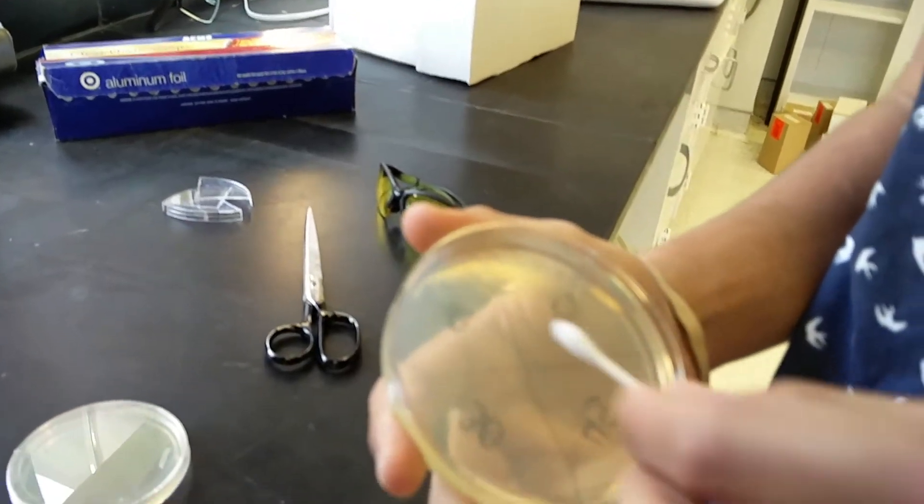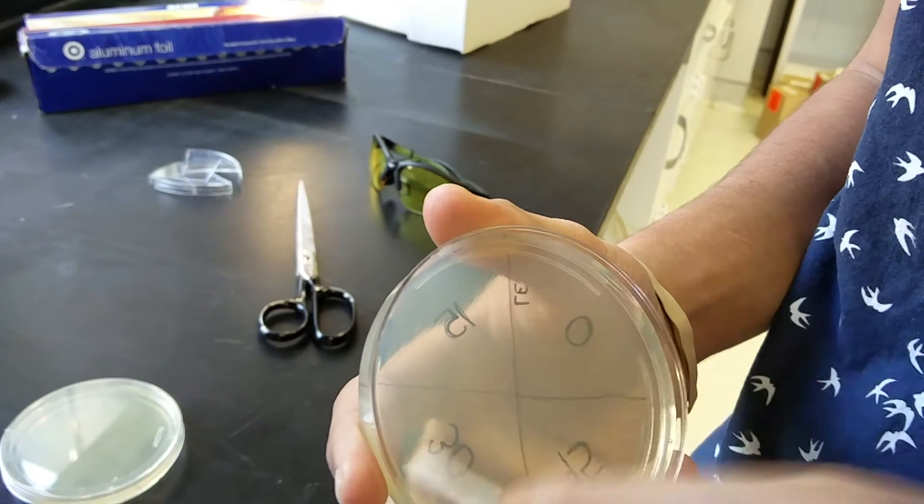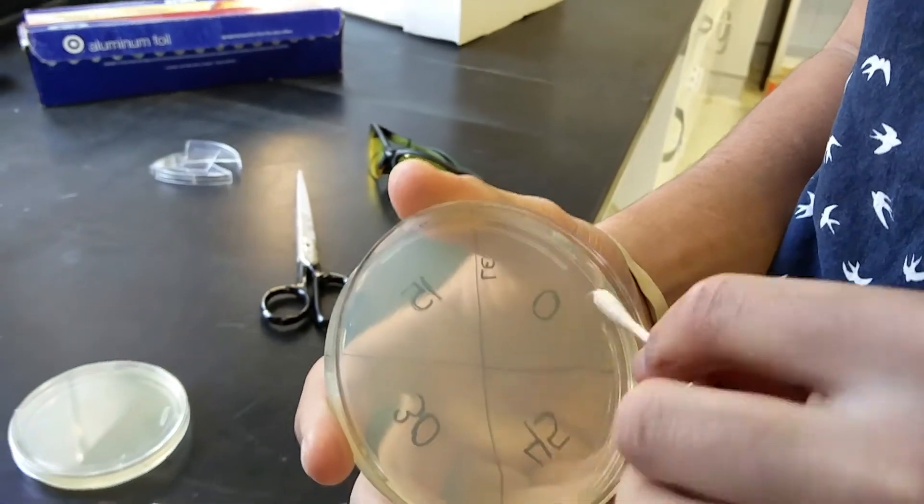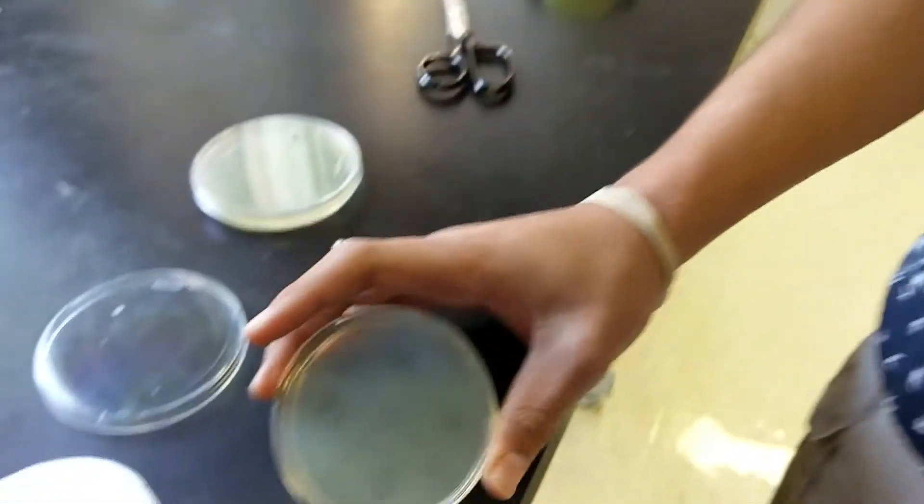Then you turn it 90 degrees and do the same thing so that you get an even number of cells on the plate. When you're finished exposing them to UV, you'll be able to compare the sections of the plate to each other.